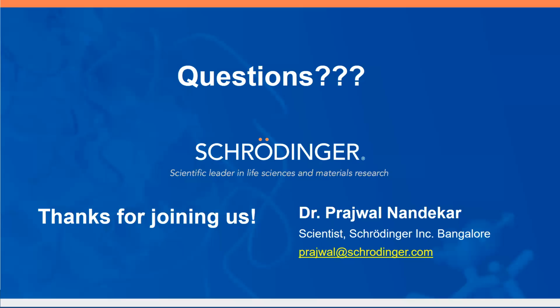Thank you. The next question is, if Maestro crashes, does it start from the crashed point, or does it have an autosave option, or do we have to set autosave options beforehand? To answer this question, all these things are already discussed in the Maestro demo. You don't need to perform autosave or anything else. Once you save your project, it is already saved. It has automatic autosave options, so you don't need to worry about it. Even if your Maestro crashes, you can start from the same position if you have saved the project initially. So I would recommend you first visit the Maestro demo video, and then your doubts will be clarified.